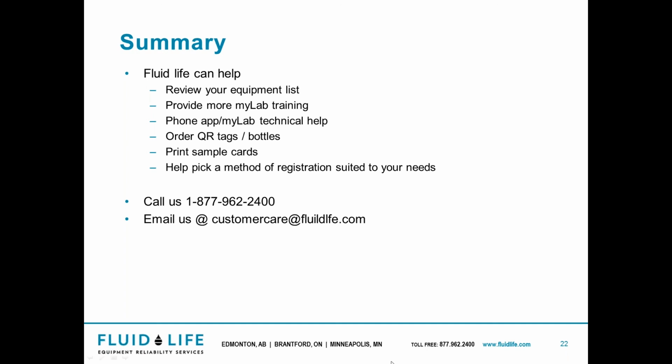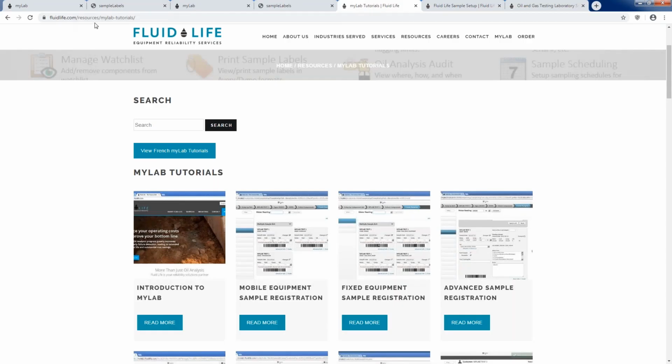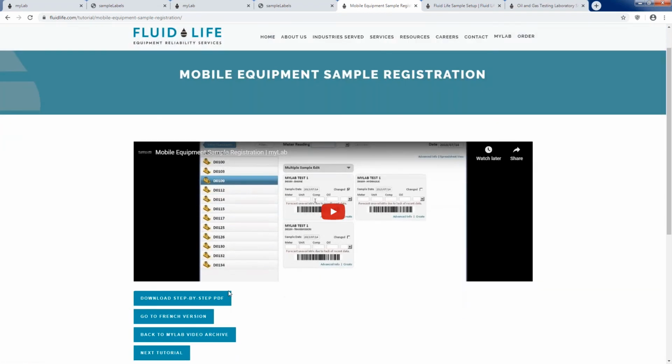Now, I'm just gonna quickly go over some of the website where I can give you guys some help. So the tutorials are very easy to find. They're under our resources tab, and then myLab tutorials, and they're all right here. So if you need some more advanced equipment registration videos or PDFs, they're easily found right here. I'll just look at this one quickly just to show you how easy it is to find. And you can see there's a step-by-step as well as a video that are very well done and very easy to go through.